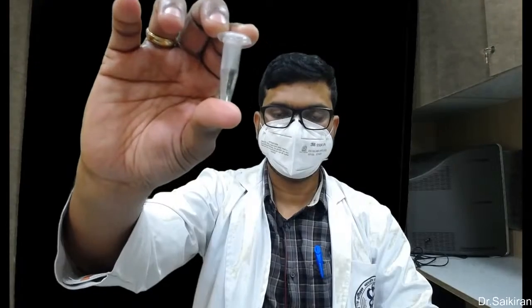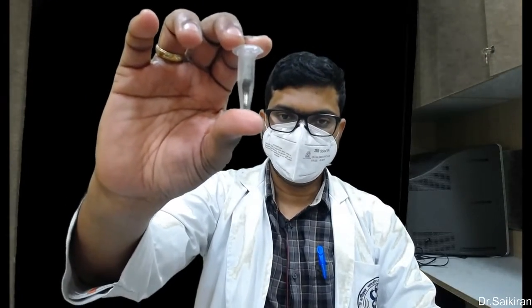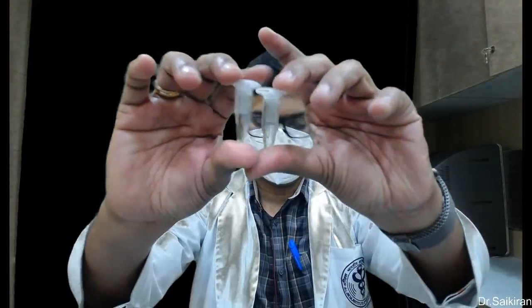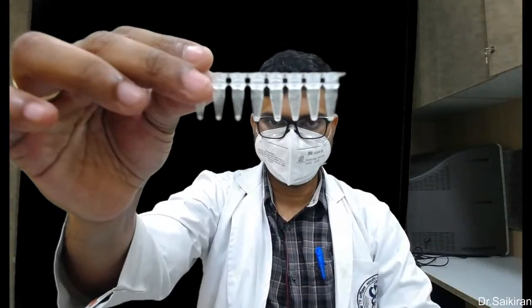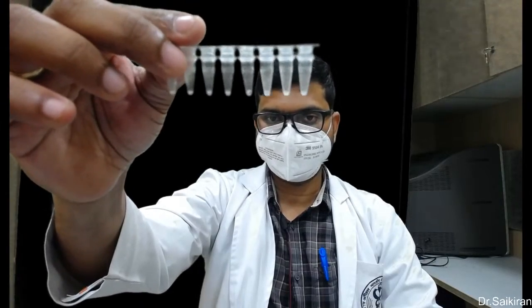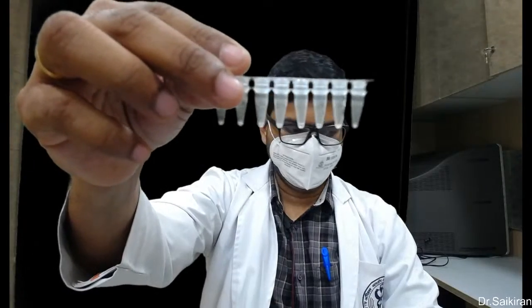These are called Eppendorfs. These are used for aliquoting. In the sense, we can store the sample or the amplified product in this, and we can store at the desired temperature. These are the PCR tubes where we can load the extracted DNA and we put in the PCR machine for amplification.